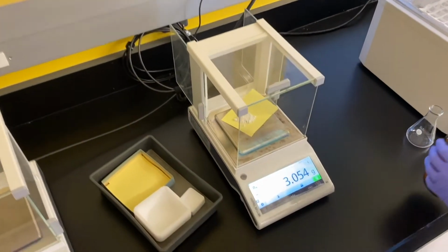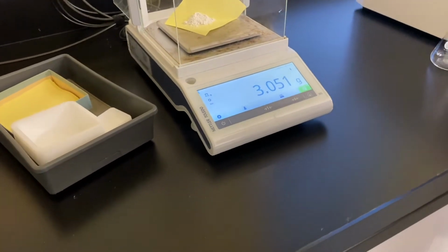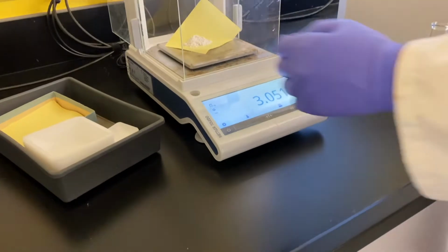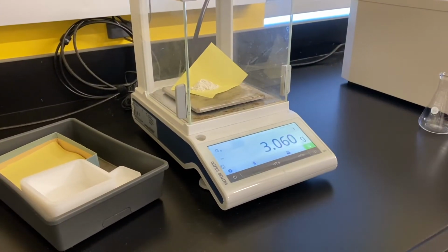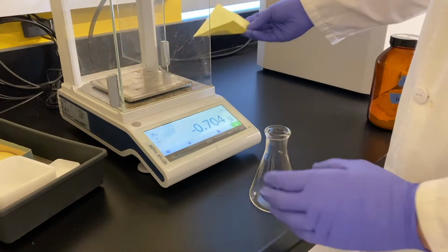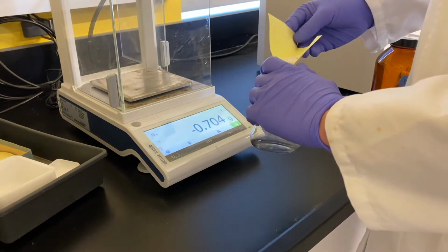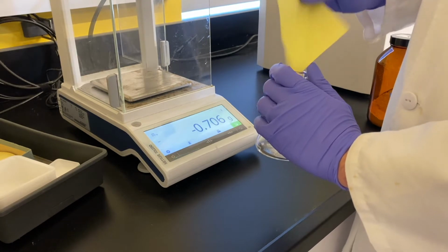You'll see with our scales, we can actually pull back the doors on both sides so we can get full access onto the scale. The reason we have these doors is that when you start getting out to that third, fourth decimal place, the air conditioning and ventilation in the room can affect the mass, because the air pushes a little bit of force on it. And so you really need those doors.